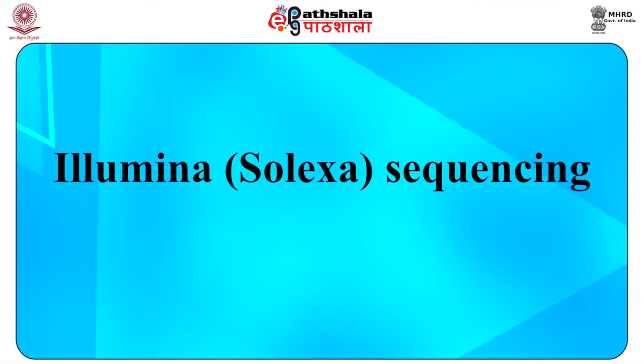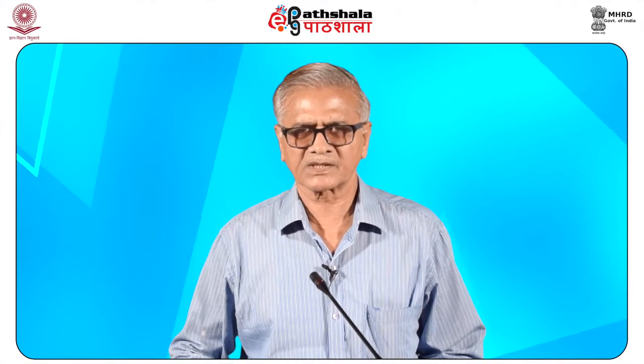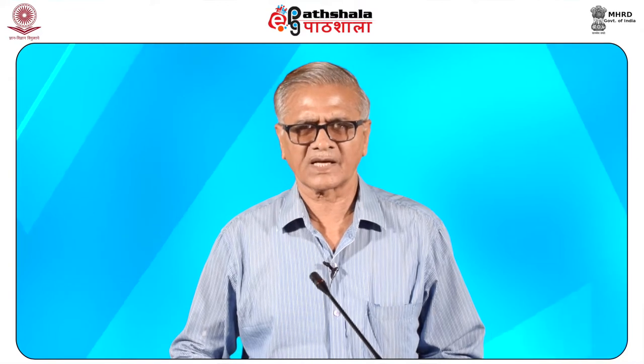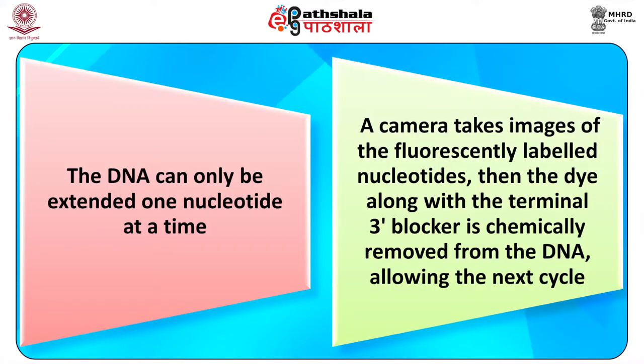Another method is Illumina Solexa sequencing. The Solexa company developed this sequencing technology based on dye terminators. In this, DNA molecules are first attached to primers on a slide and amplified. This is known as bridge amplification. The DNA can only be extended one nucleotide at a time. A camera takes images of the fluorescently labeled nucleotides, then the dye along with the terminal 3 prime blocker is chemically removed from the DNA, allowing the next cycle.